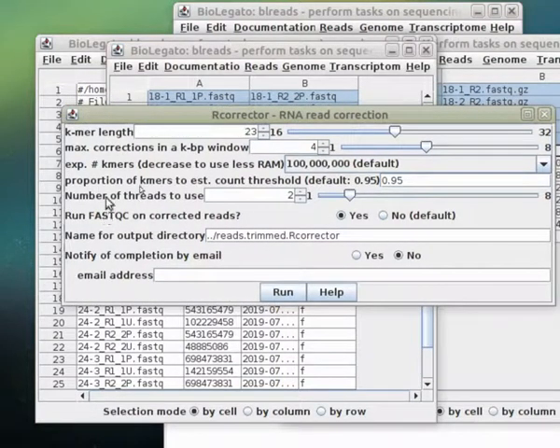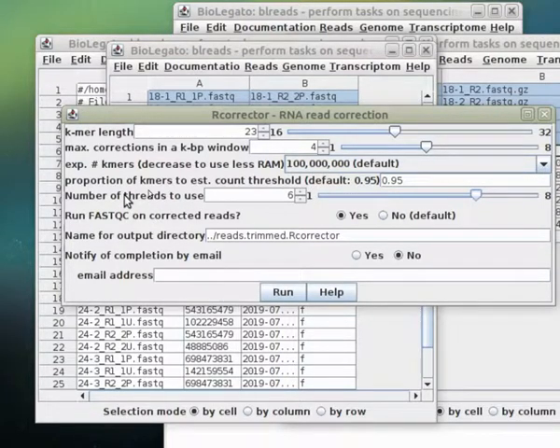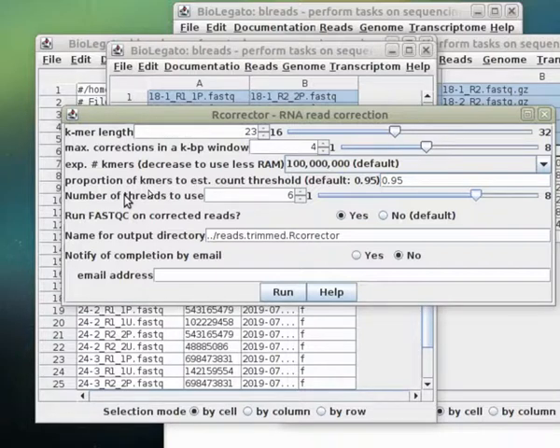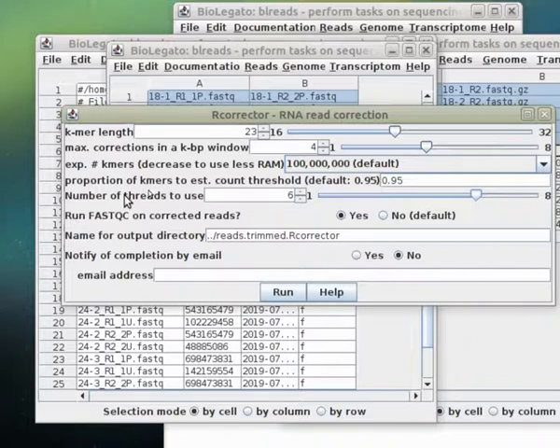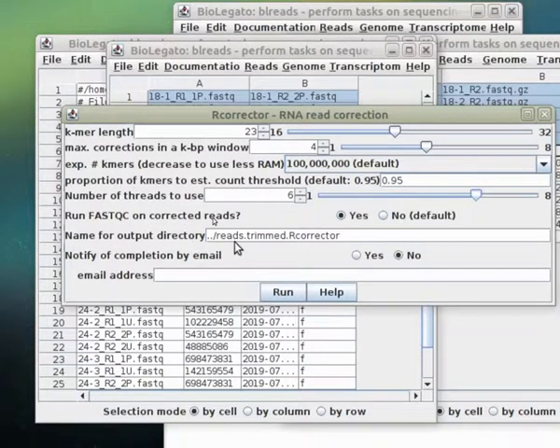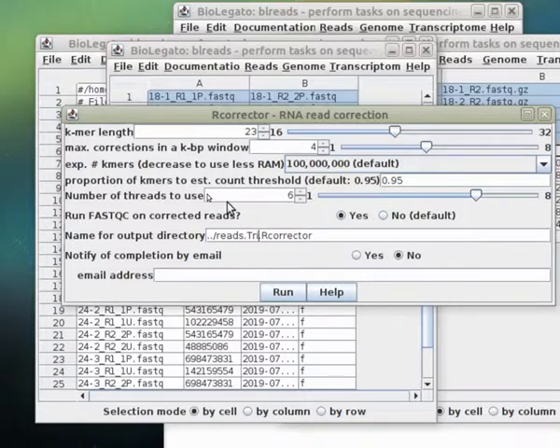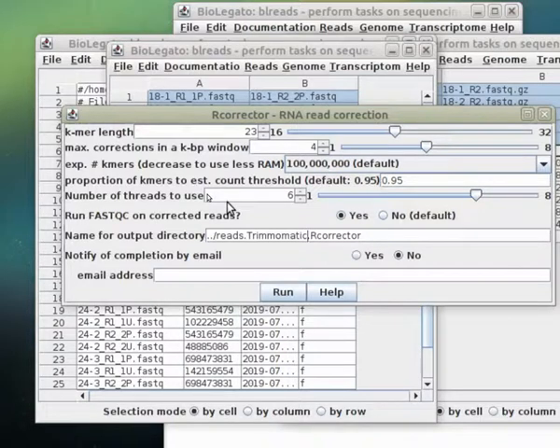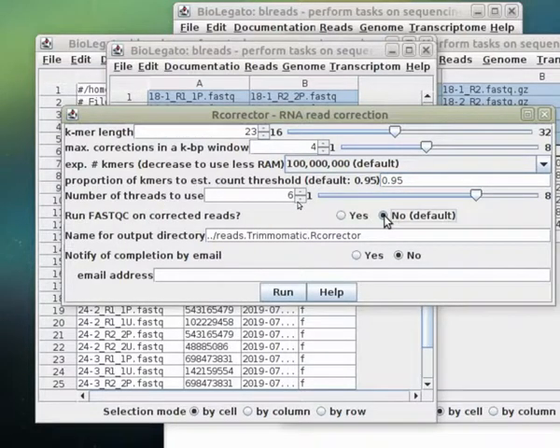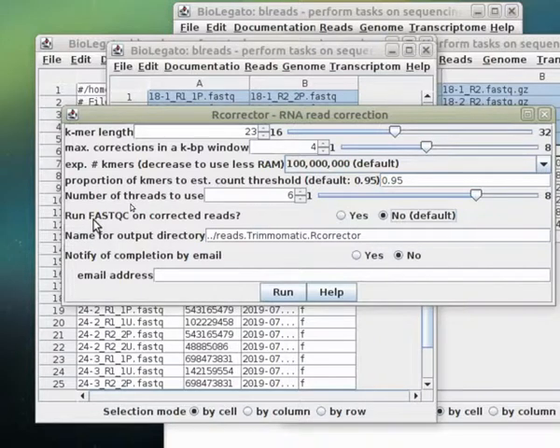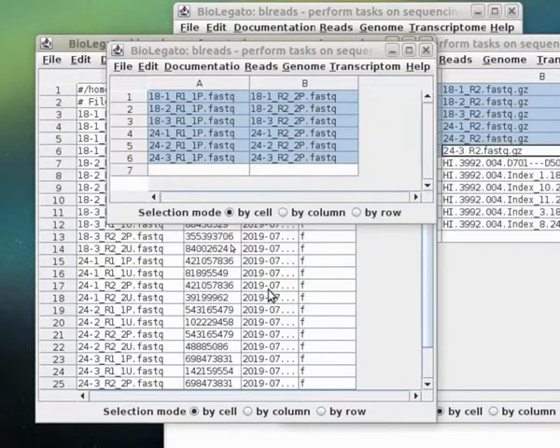In most cases, you can go with the defaults, although I am going to increase the number of threads. This machine has eight CPUs, so I'm going to use six of them, and the memory is 16 gigabytes. The output is going to be sent to a new directory called reads.trimmed.Rcorrector. I'm just going to change that to be a little more specific to Trimmomatic in case I wanted to do one run with Trimmomatic, another run with TrimGalore. I would have the output going to different directories, and then I could compare the results. Just to speed things up, I'm going to turn off automatic FastQC running on the corrected reads. Then I'm going to launch the program.